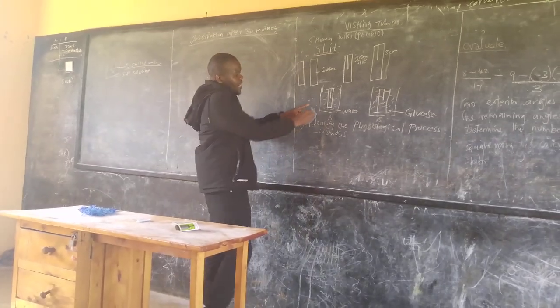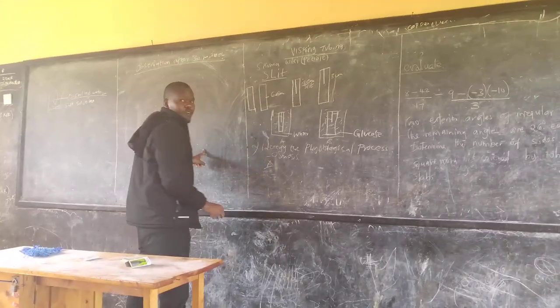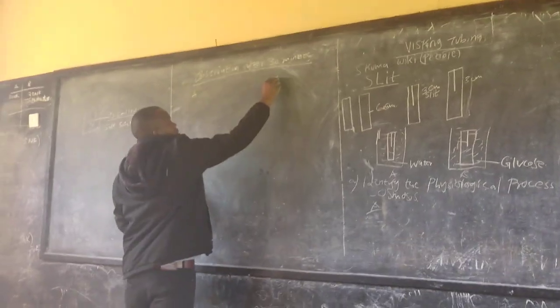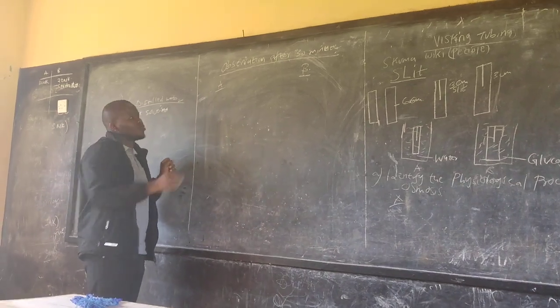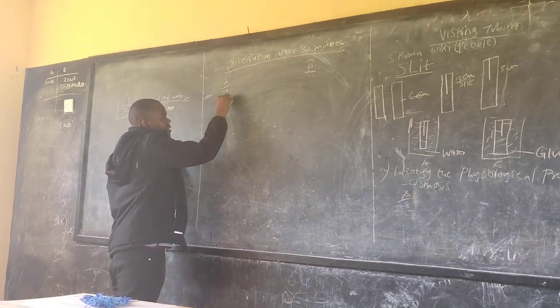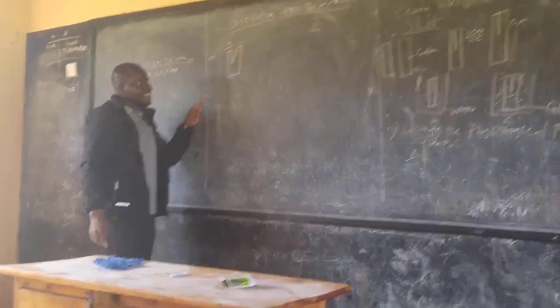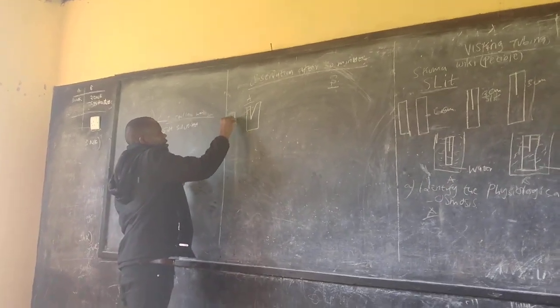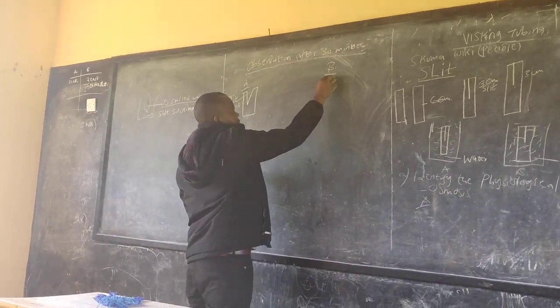So the first drawing, let's do a drawing of this one. For A, the drawing should be something of this kind. Let me draw it out. So you are told you draw for A and you draw for B. The first one will open. Yes. So for the opening it will be something of this kind. Are you seeing the difference? Yes. The slit has done what? Okay. So we are saying the slit opens. Then this other one.